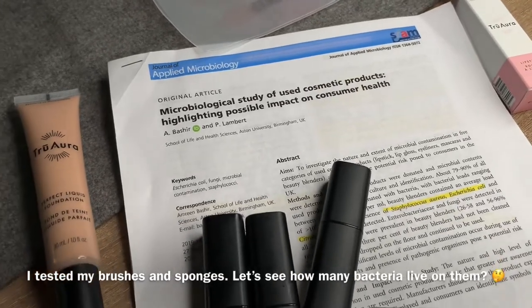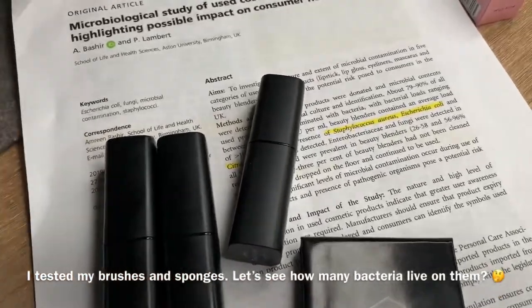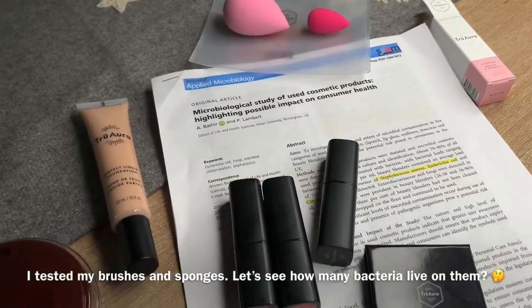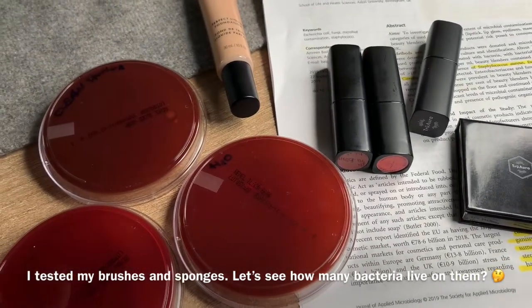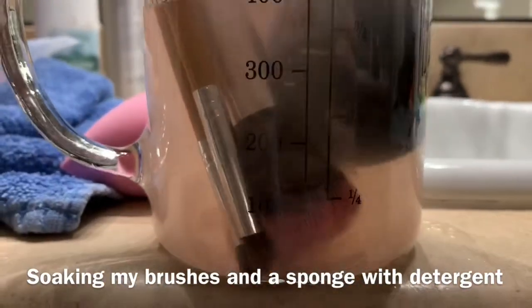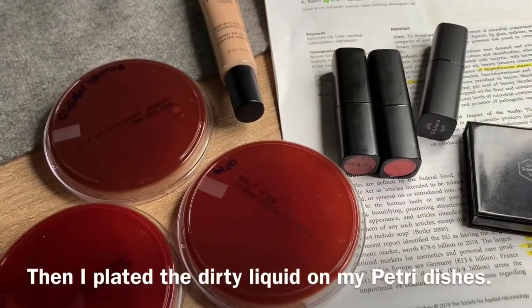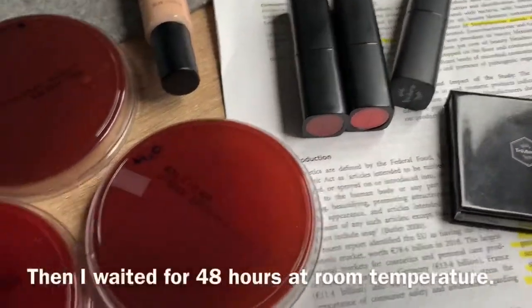They found that pretty much all our cosmetic tools like lipstick, mascaras, and sponges — especially beauty blenders — are highly contaminated with different bacteria, and some of them are actually pathogenic bacteria. So I decided to take my brushes, soak them in water with detergent, and then check how contaminated the water was, and also check some of my lipsticks that I'm using.